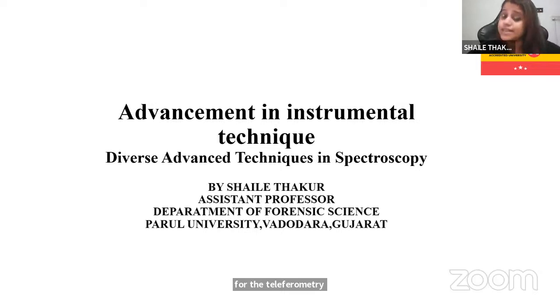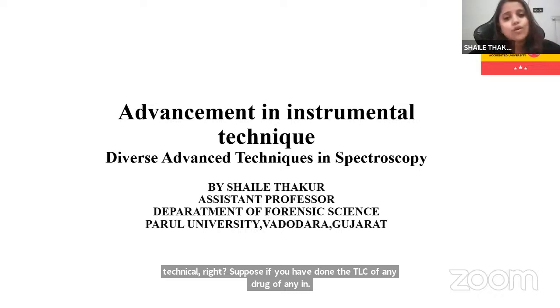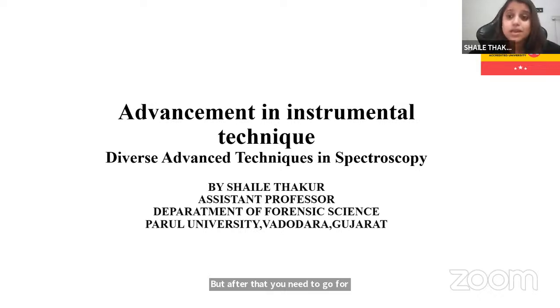The confirmatory test must be done most of the time by some chemical analysis, but many times it is done by an instrumental technique. Suppose you have done the TLC of any drug or any ink, after that you need to go for the confirmatory examination.